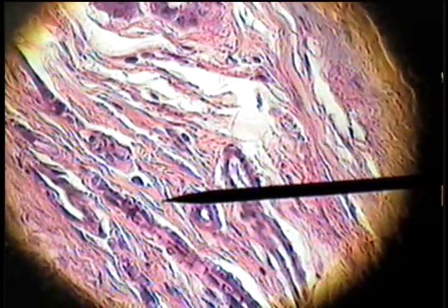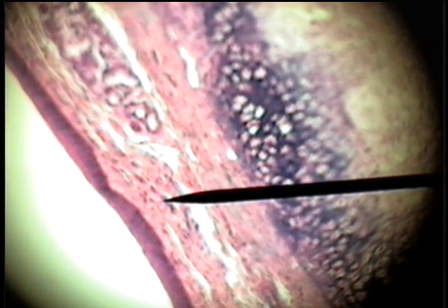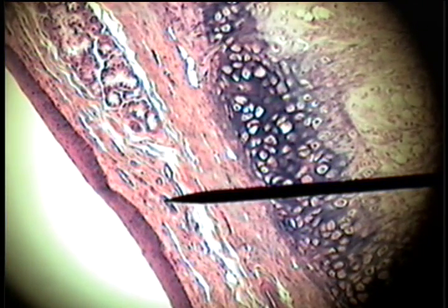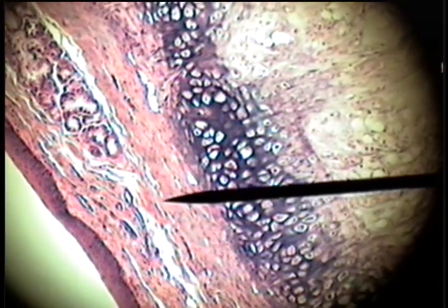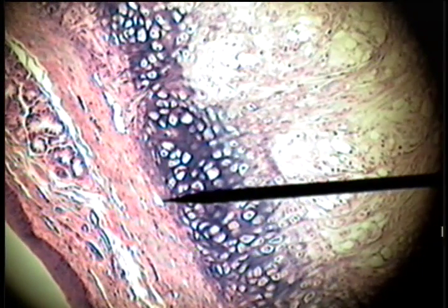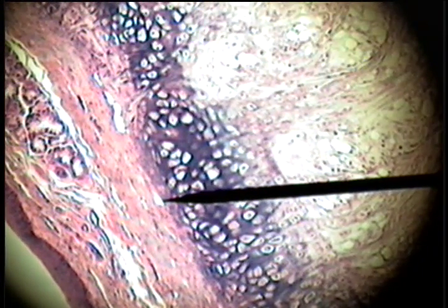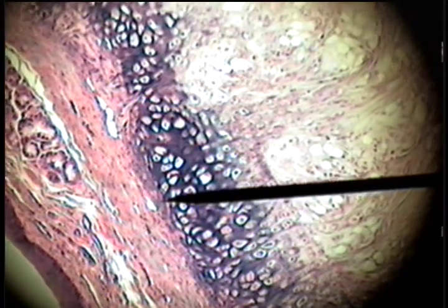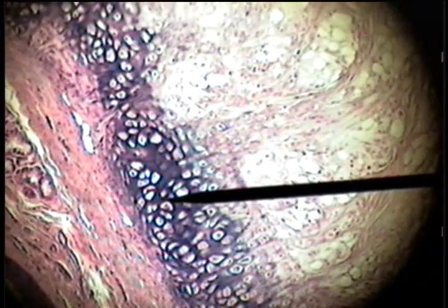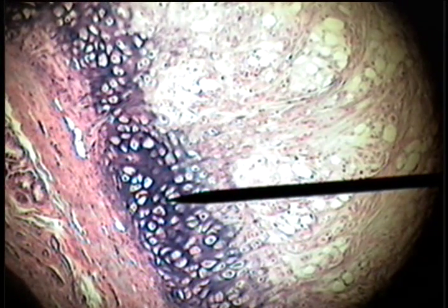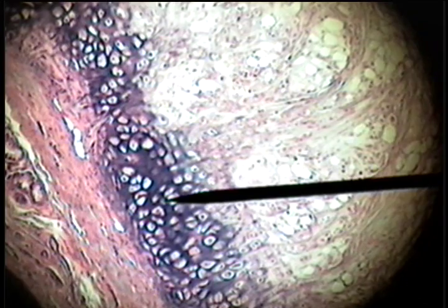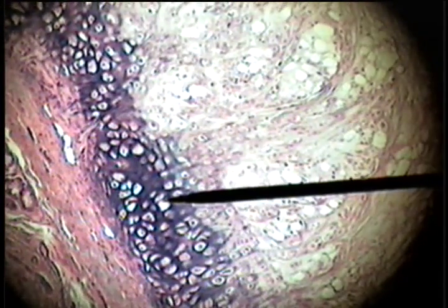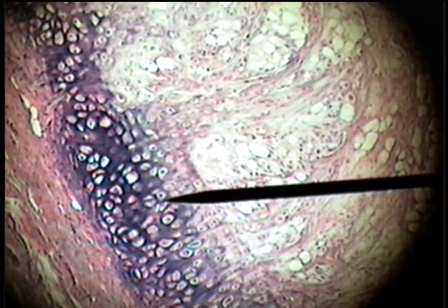As we move toward the interior of the epiglottis, there is an elastic, bendable cartilage — this cartilage is elastic cartilage. It has a perichondrium on the outside, the matrix is basophilic or deep blue, and there are chondrocytes.